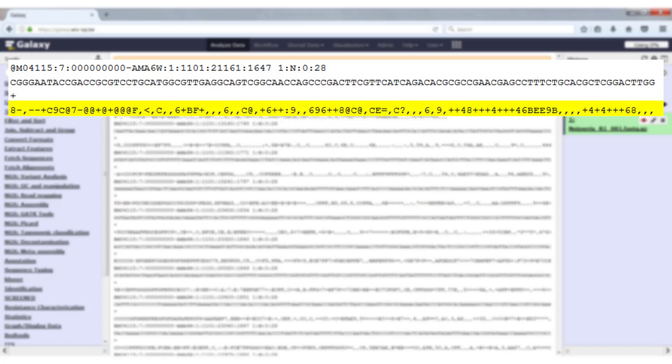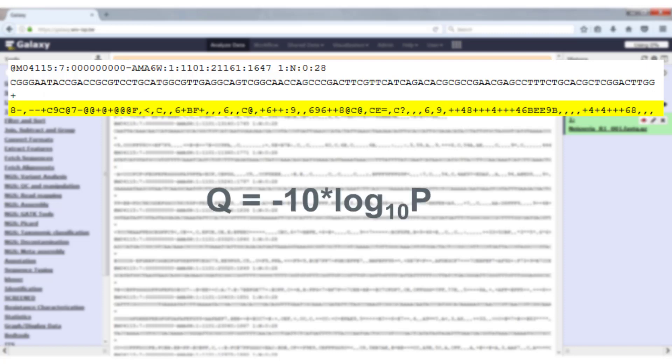The last line holds the quality scores of the base calls. The quality of each base is located directly below that base. This quality is based on a Phred score, and a Phred score is calculated by this formula.